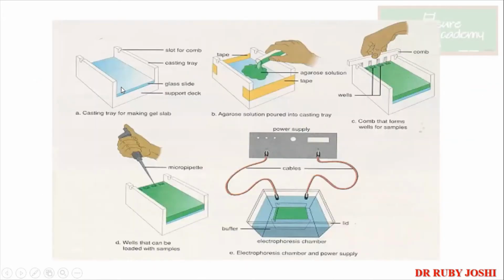So you have got the gel caster. You're going to load it. Now here if you see the difference, people have loaded it over here with the tape. It is sealed with tape, okay? But nowadays you have a gel caster in such a way that you don't have to use tape. Here you are just given screws to tighten, so that the plate comes and you tighten it. You can pour it over there. Then you pour it. You allow the entire thing to solidify. Then remove the tape.